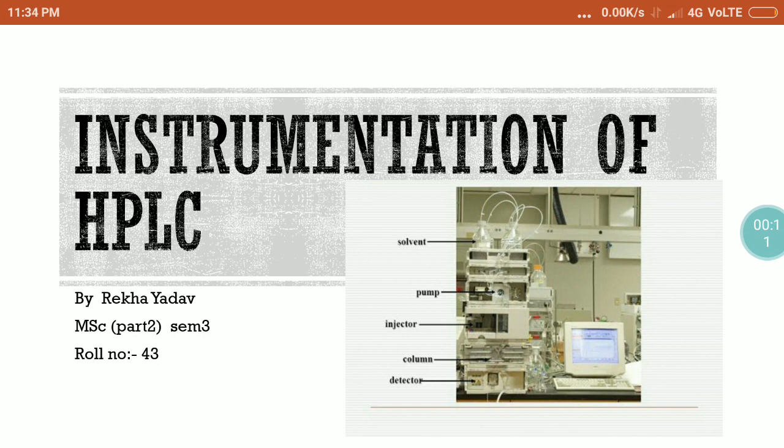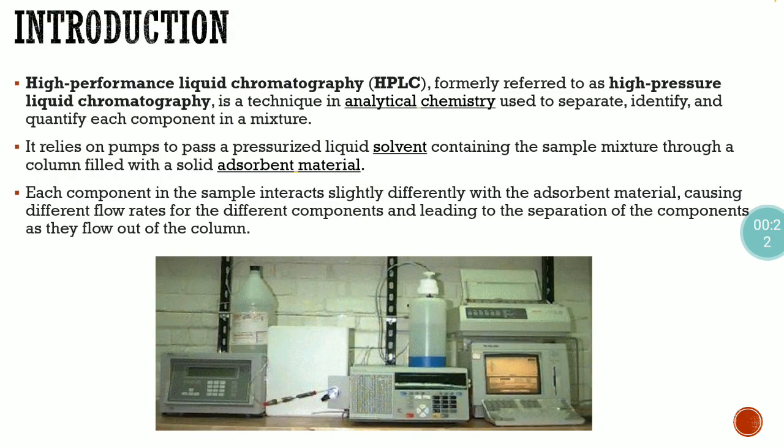So before we go into the main topic, I would like to explain what is HPLC, their types and on which principle HPLC works. So first one is introduction.